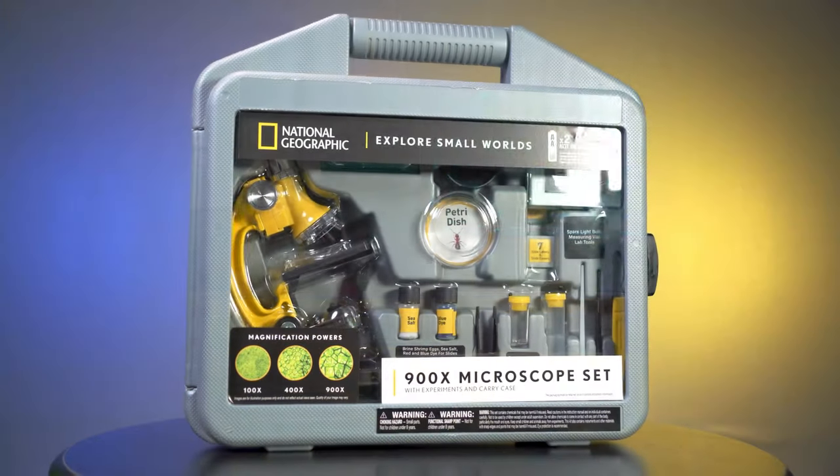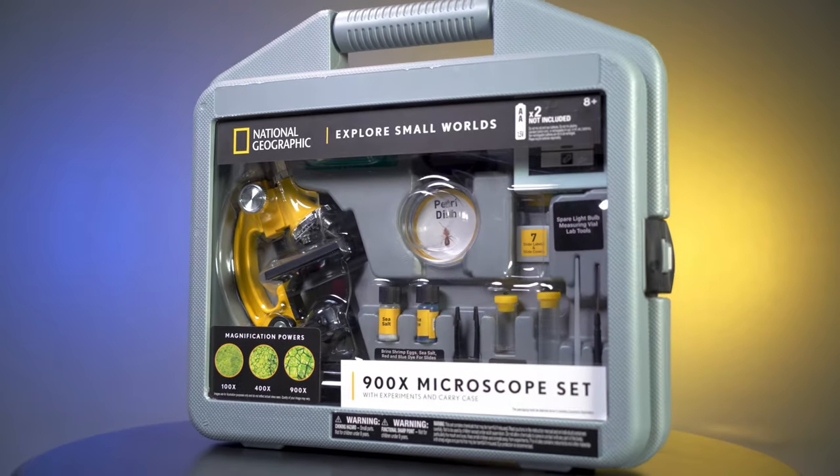Housed in a hard shell case, you can go anywhere with the National Geographic 900x microscope set.